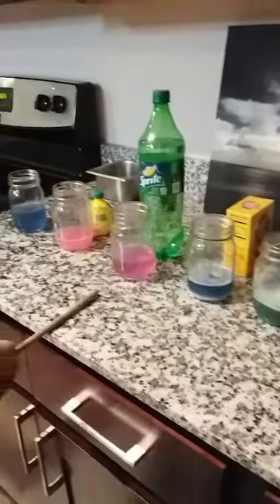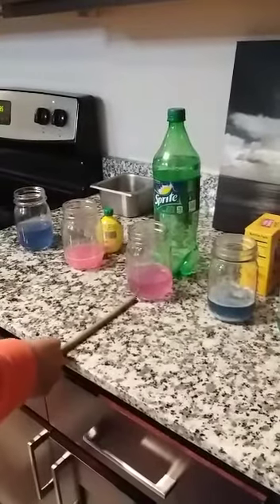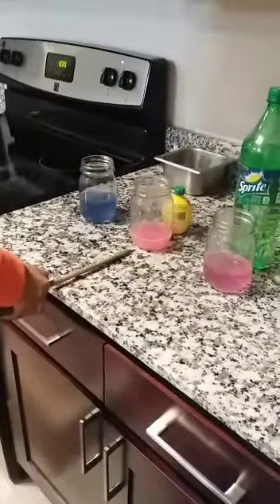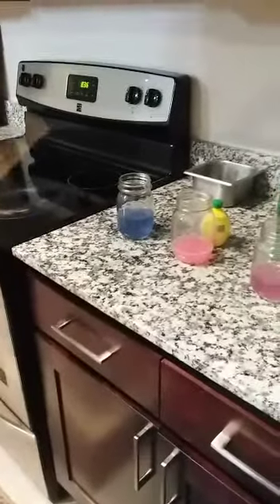This one is more along the reddish color, but it's not red. It's kind of faded. I'd give it maybe a 4 or 5, for acid. This one is really bright. I'd give it a 1 for lemon juice. And then this water is very, very blue. Solid 7. So now we are going to mix our vinegar into our baking soda mixture. Can I add some vinegar to the baking soda mixture?